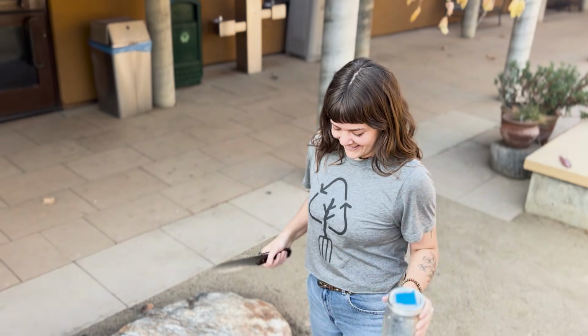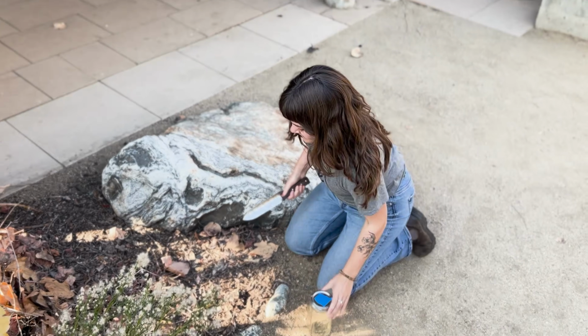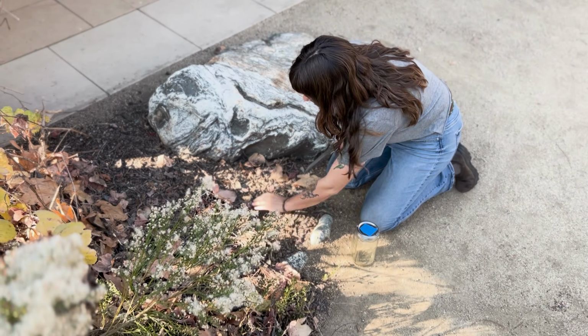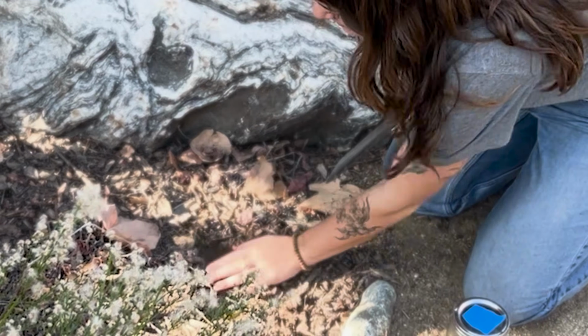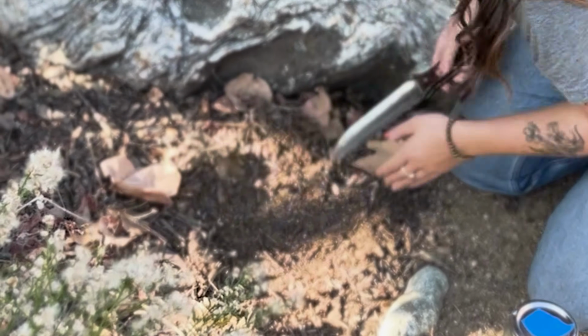Now let's talk about gathering your samples. You can use a hand trowel or shovel to collect about a quarter cup of soil or compost. If you'd like to collect a representative sample, you can also collect small scoops of material from several different spots in your sample area and mix it all together. Be sure to clear away any mulch or leaf litter covering the topsoil.